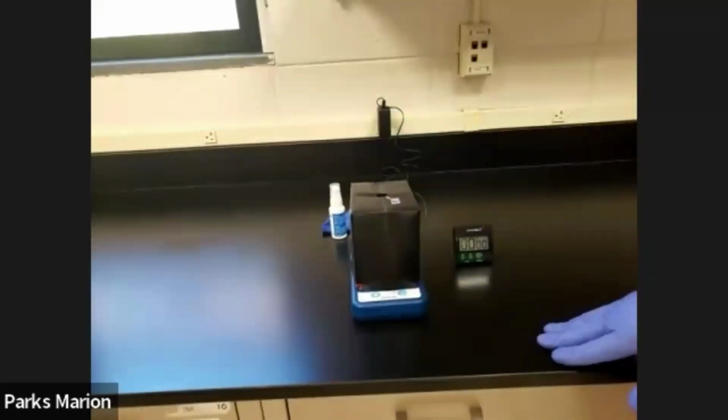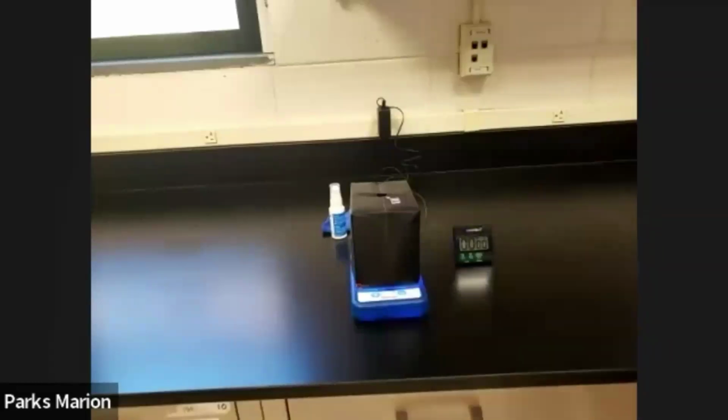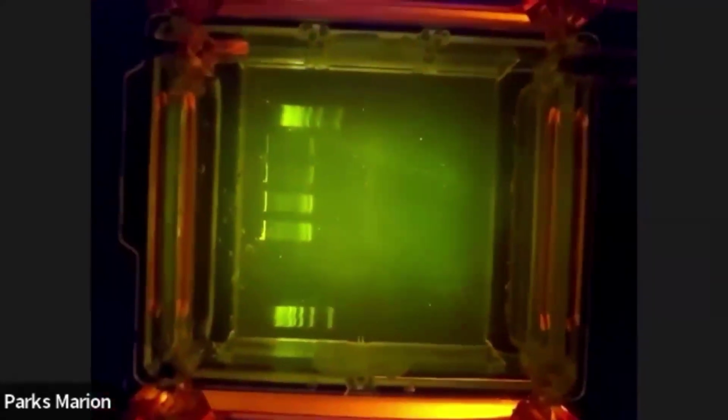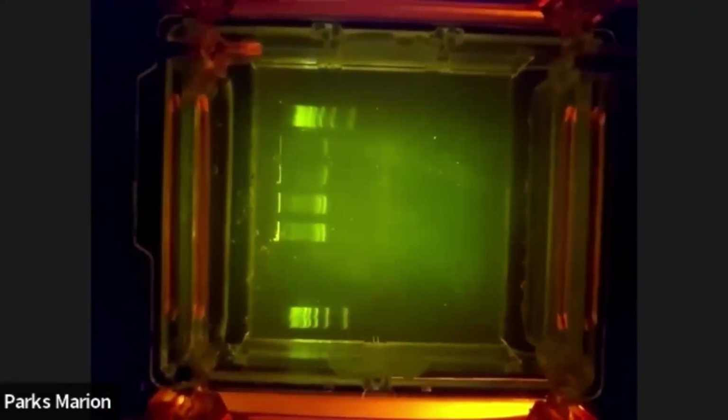Turn off our machine now that 45 minutes is up. Turn on the light, and we're going to just zoom in here. And take a look.